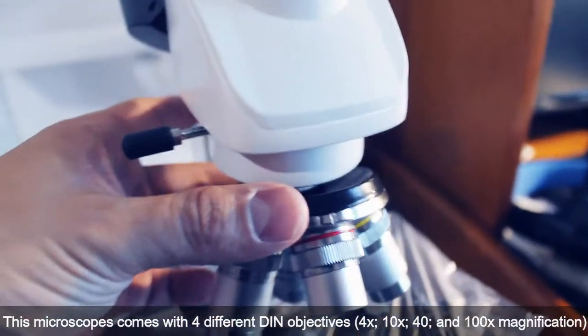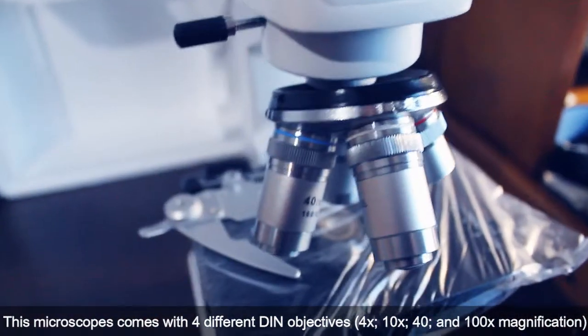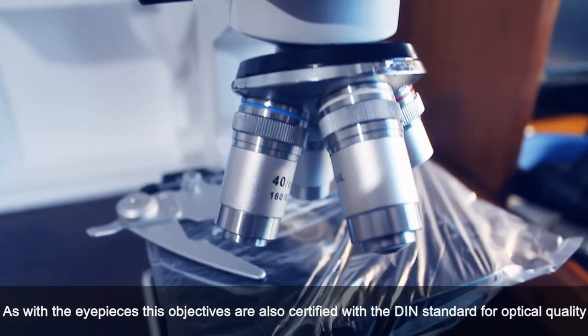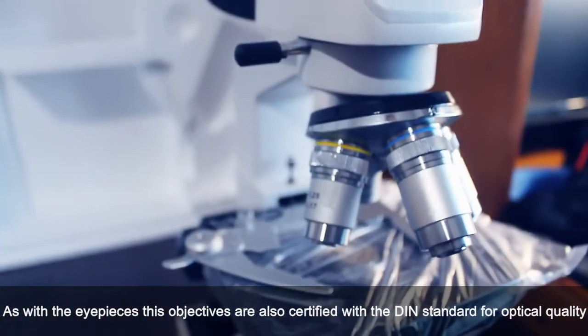This microscope comes with four different DIN objectives: 4x, 10x, 40x, and 100x magnification. As with the eyepieces, these objectives are also certified with the DIN standard for optical quality.